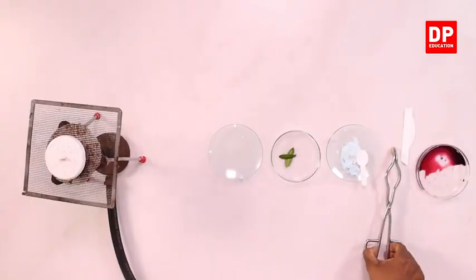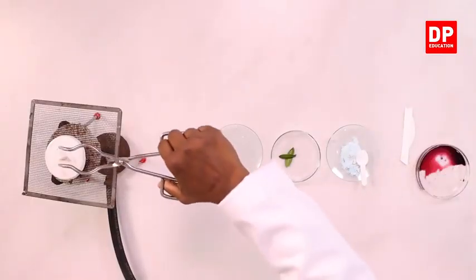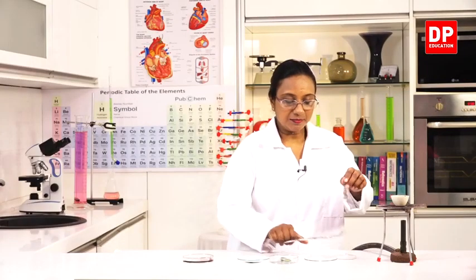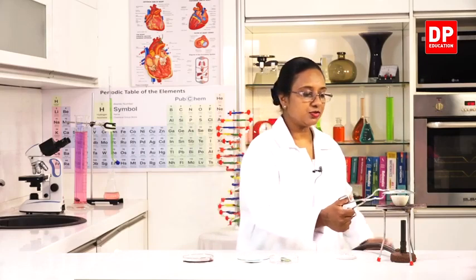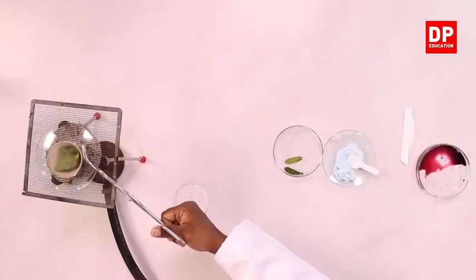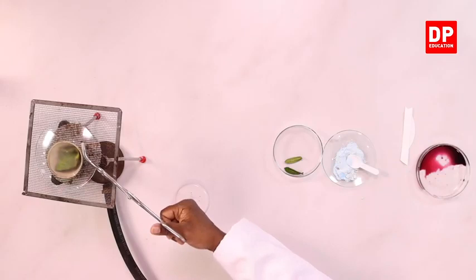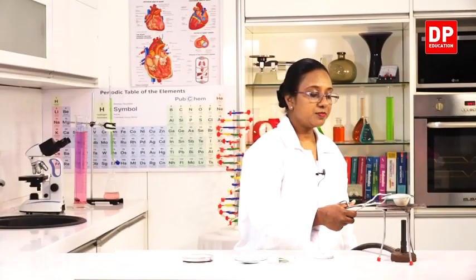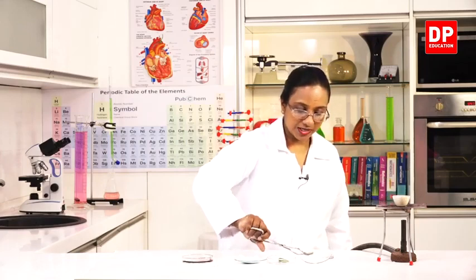It has been heating for some time. I will remove the lid of the crucible using a pair of tongs and place this watch glass over it so that you can see the vapor coming out and condensing on the watch glass. We will collect that vapor. Now you can observe, students, that there is a liquid vaporizing, coming out of the sample and condensing on the watch glass. I will remove the watch glass now.